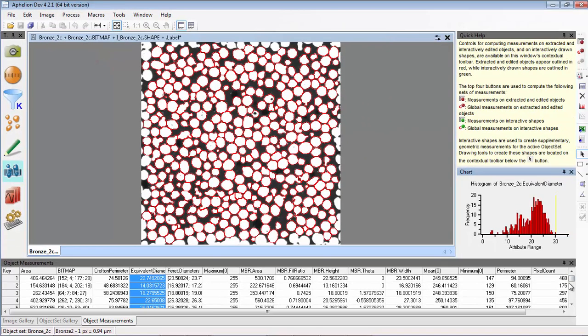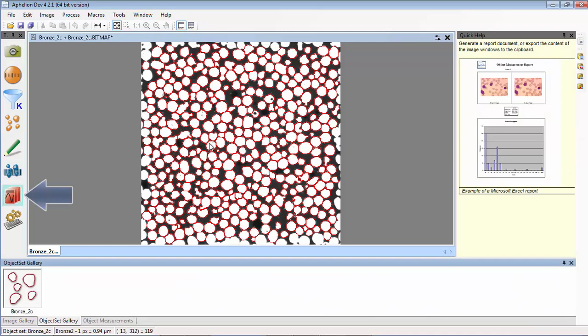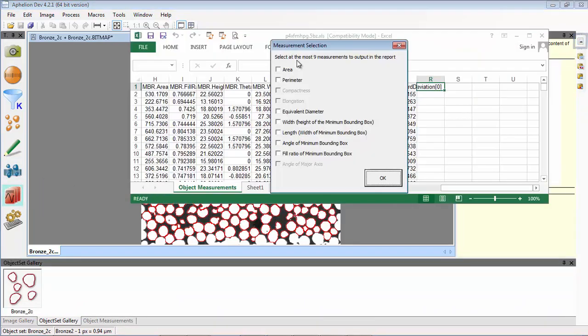In this case, there are more than 350 particles that were measured. This is a lot of data, but it can be easily exported to Excel, and a summary report will be quickly created by using the report generator.